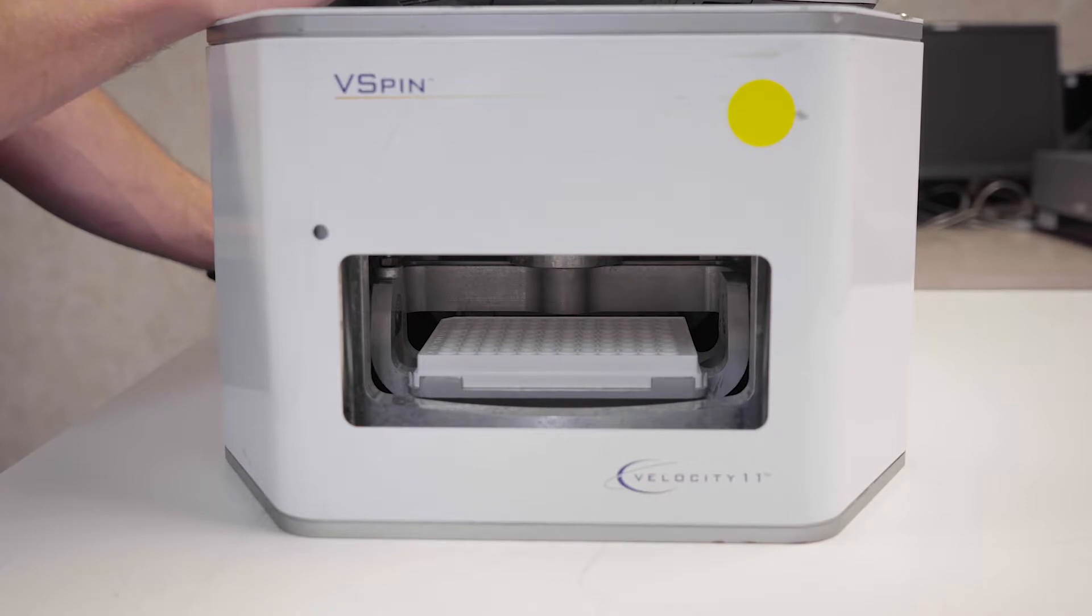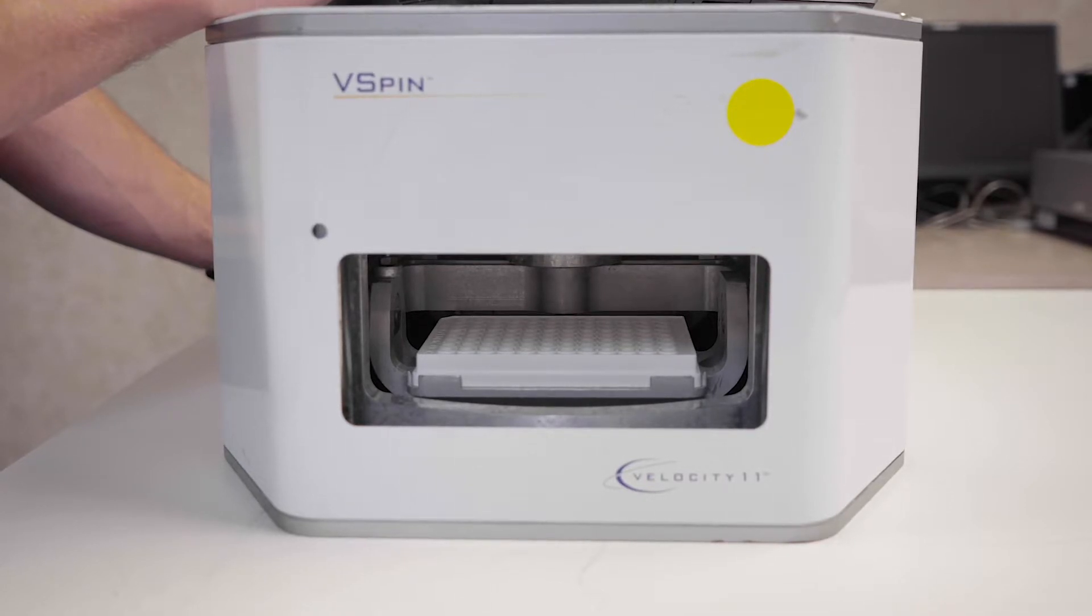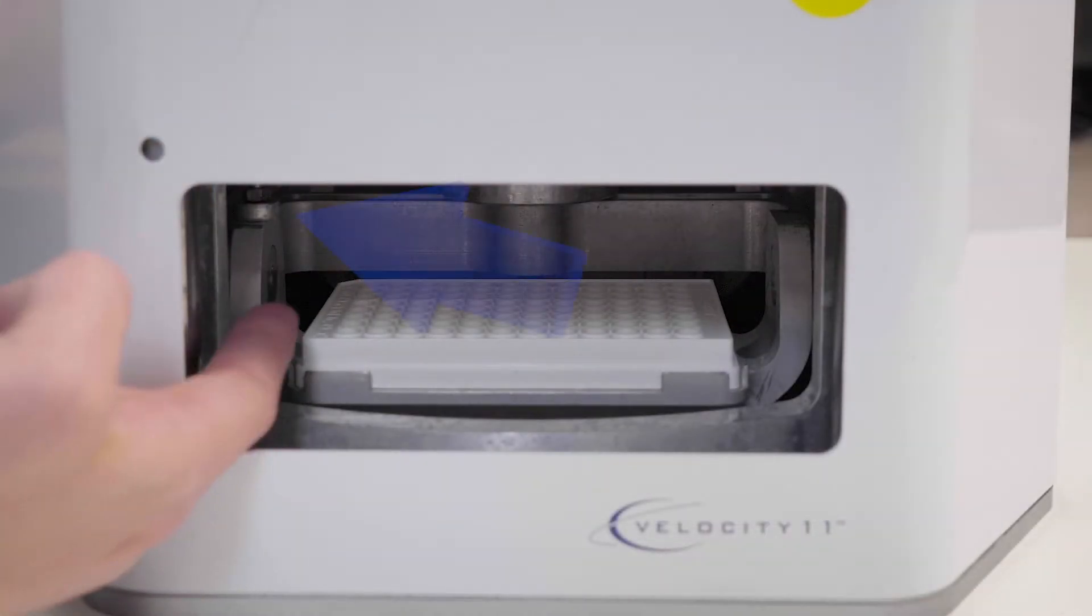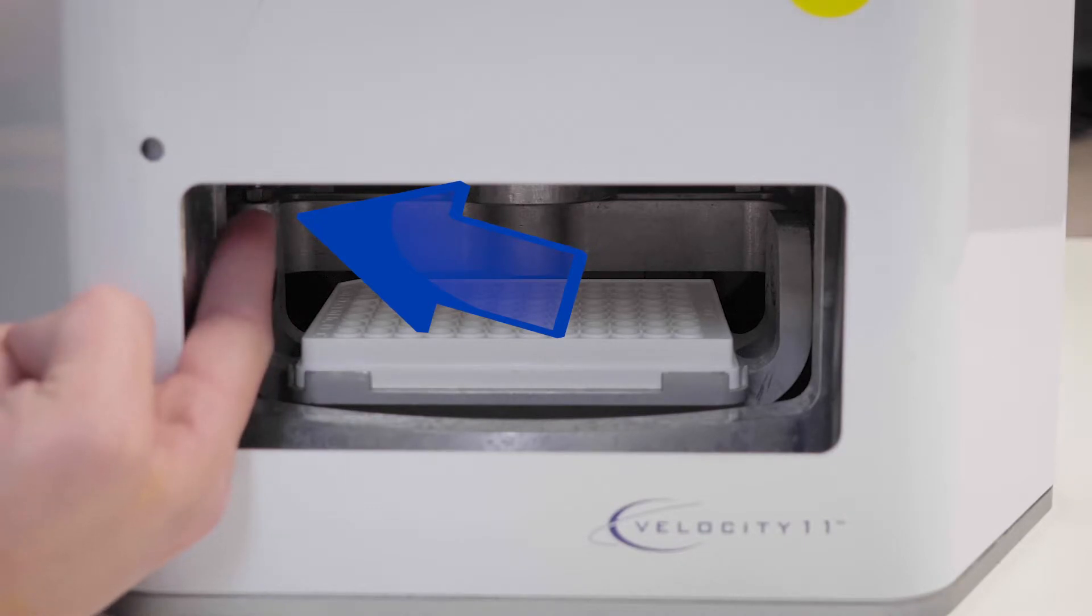When you look at the bucket, it should line up straight in from the door. You can also see the bucket lock alignment on the shoulder of the bucket.